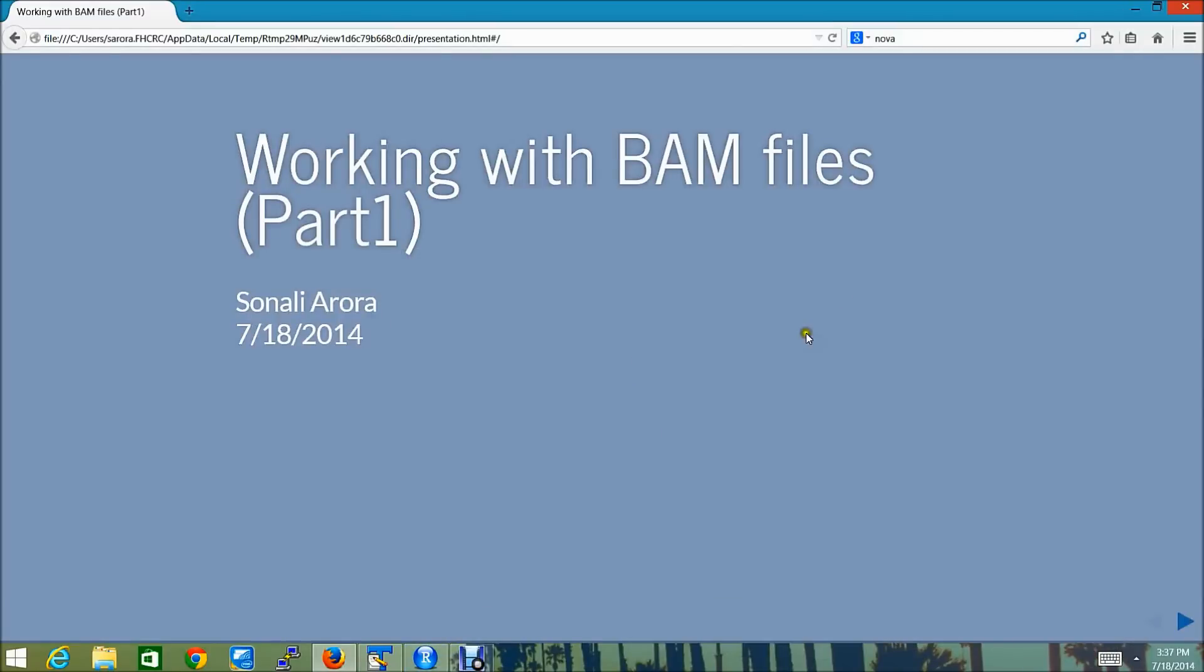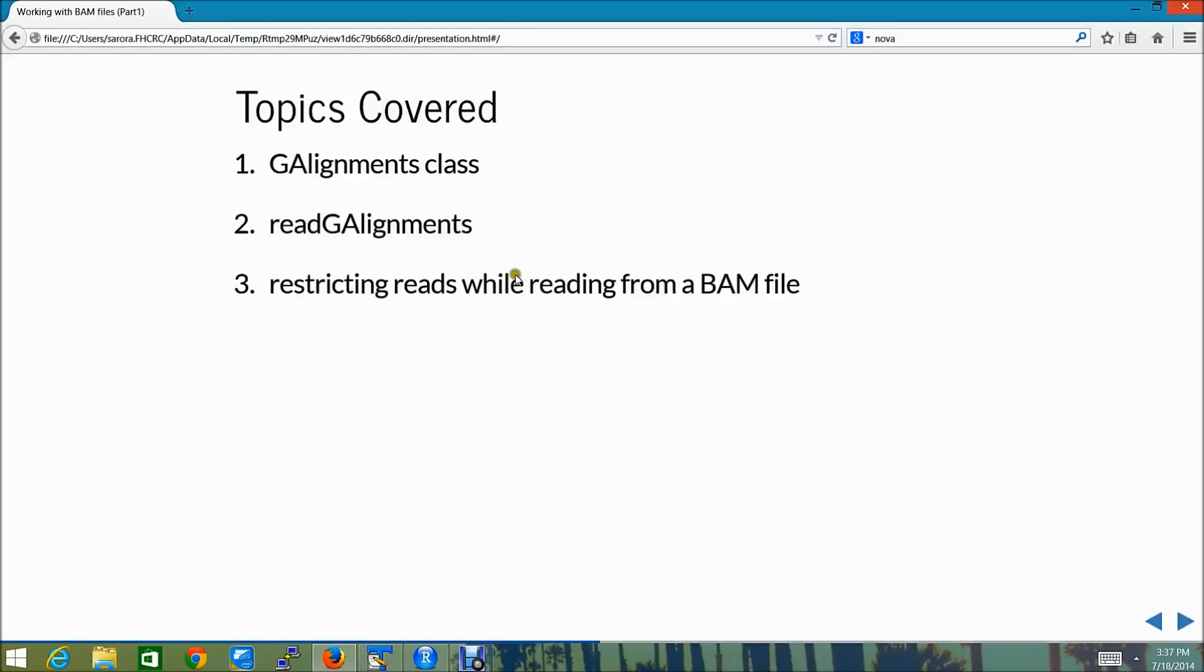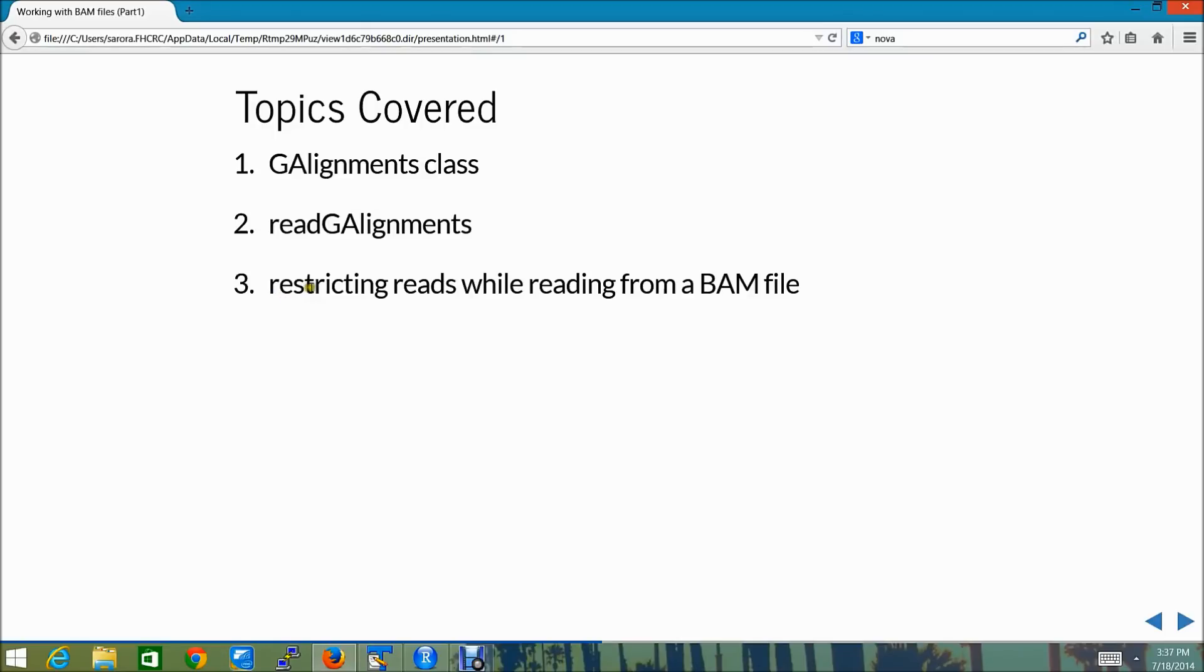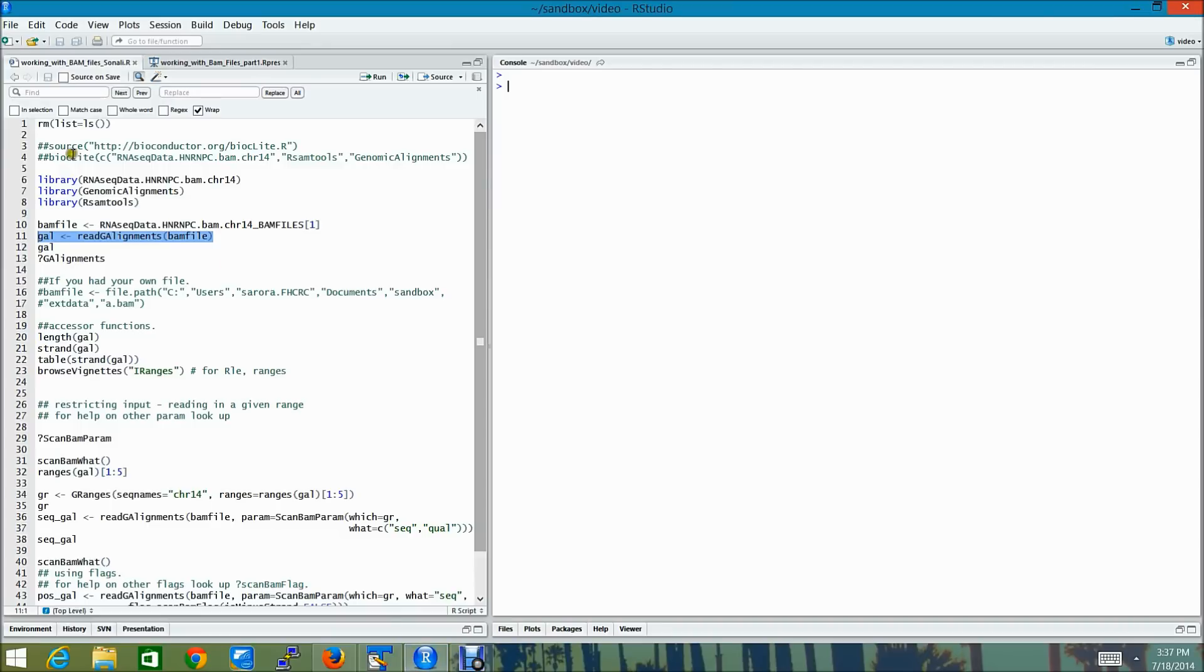Hi, my name is Sonani and I will be talking to you about working with BAM files in Bioconductor. The topics that I will be covering today are the GAlignments class and the readGAlignments function from the GenomicAlignments package. I will also be showing you various examples of restricting reads while reading in from a BAM file.